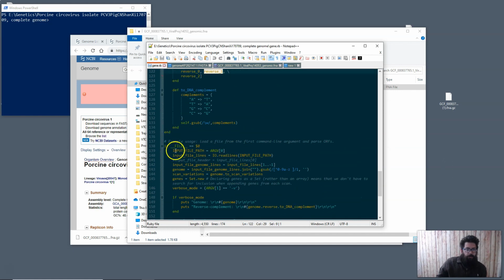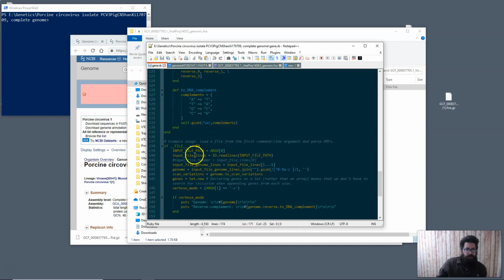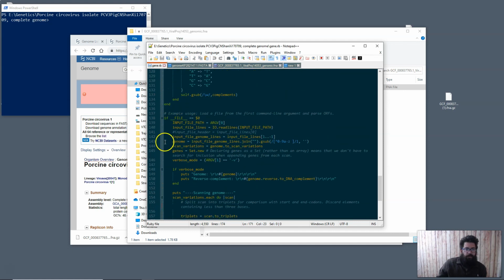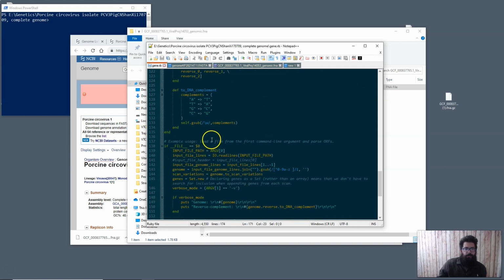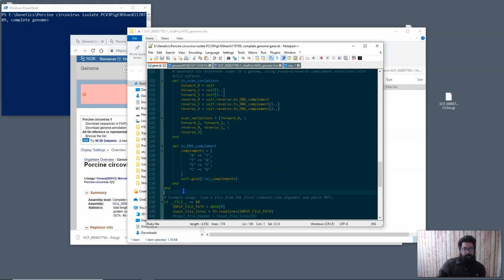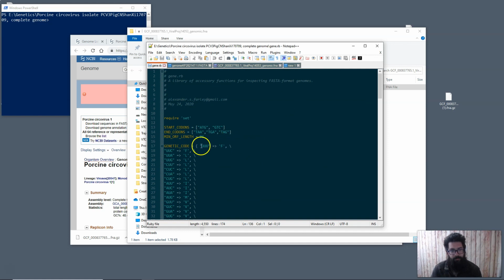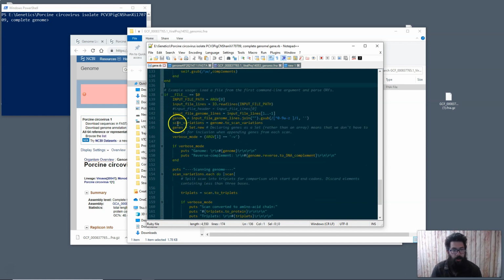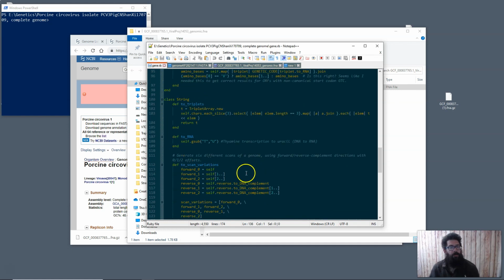Okay, so basically the file, this part here is a little bit less exciting, not really theoretical, but it's just opening up that file, taking your inputs, putting it into the functions up above, and then printing it out for you. So from here to the top is the actual theoretical meat of parsing the genome, and the stuff down below is just sort of front end, you could say.